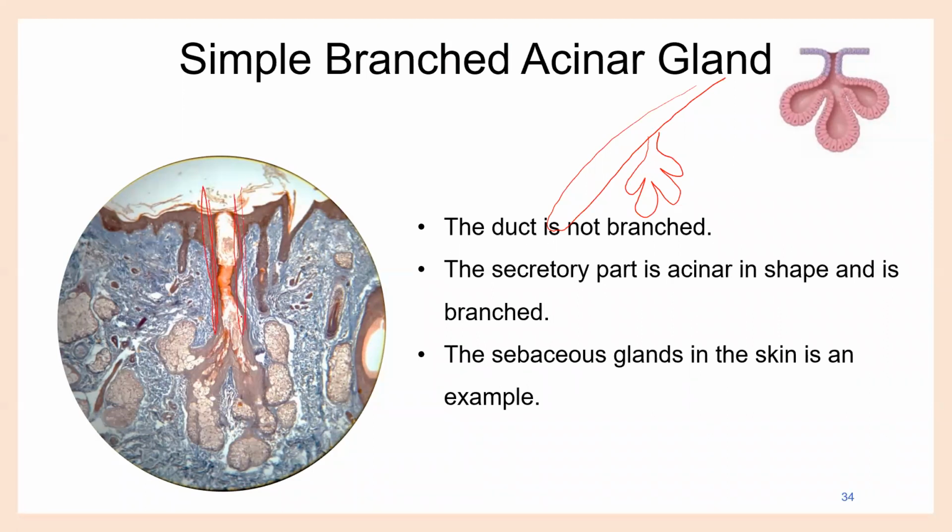Okay, so this is a special stain of skin. This is thin skin, right?